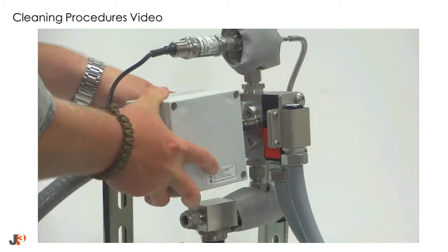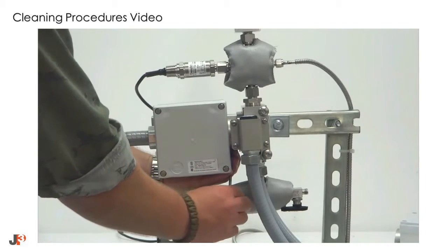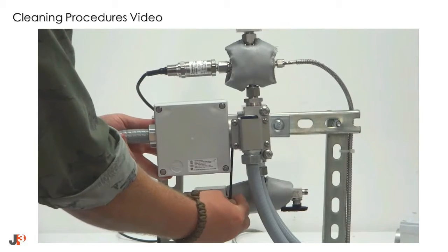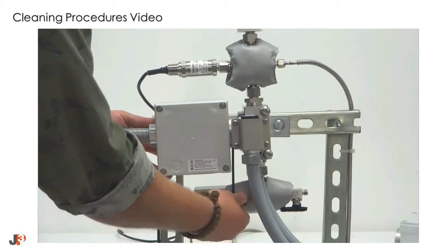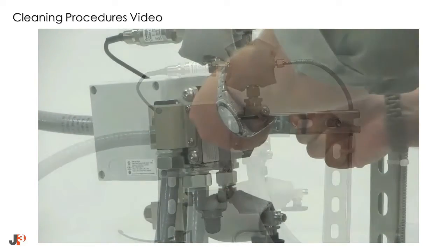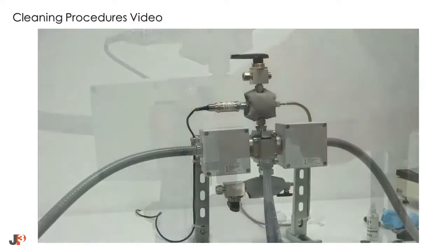Remove the dust cap and reinstall the collimator housing mount. Once reinstalled, retighten the collimator housing mount set screw until snug. Do this for both sides.